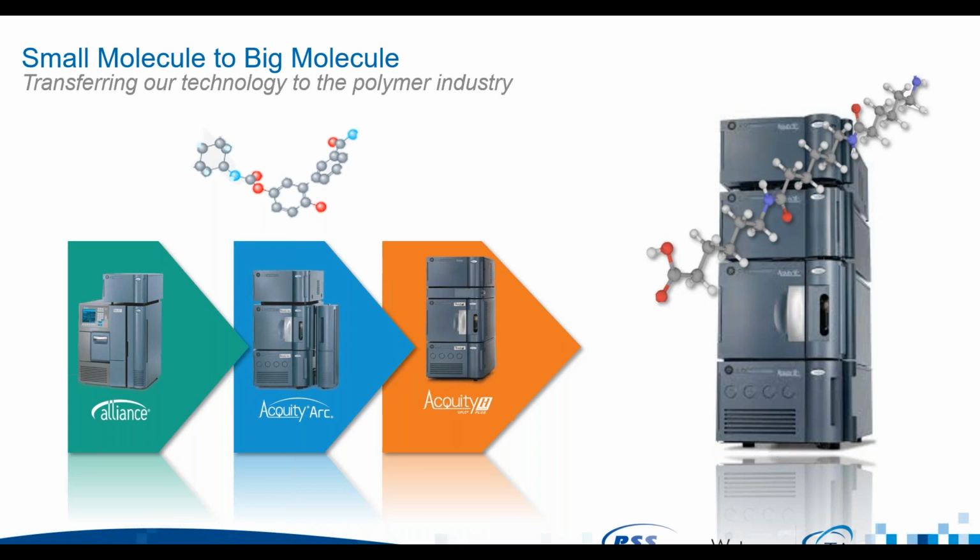And then this year we've joined forces officially with PSS to combine that high resolution separation with dedicated 2D software and expertise. And on that point, I will hand you over to the expert on 2D separation, Danny, to tell you more about PSS and the finer details of 2D chromatography.